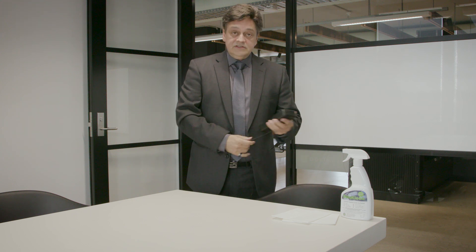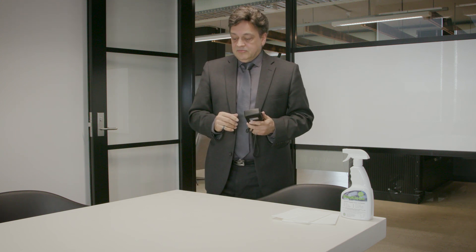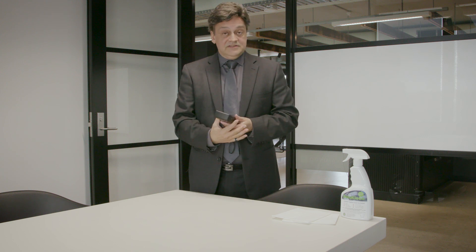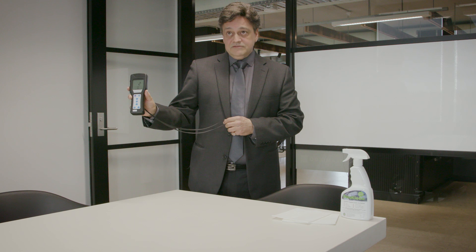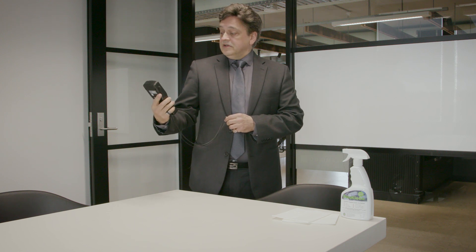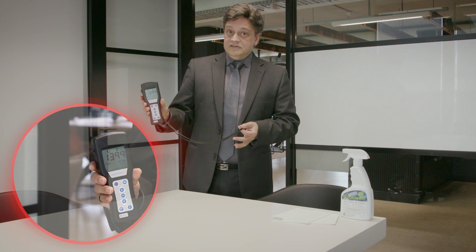What we're after while it's counting down: anything under 10 is very safe, very good. Anything above 30 is a fail, which means it's a concern. We're about three or four seconds off reaching the result, and the result has come up at 1,399. So that's certainly above 30.